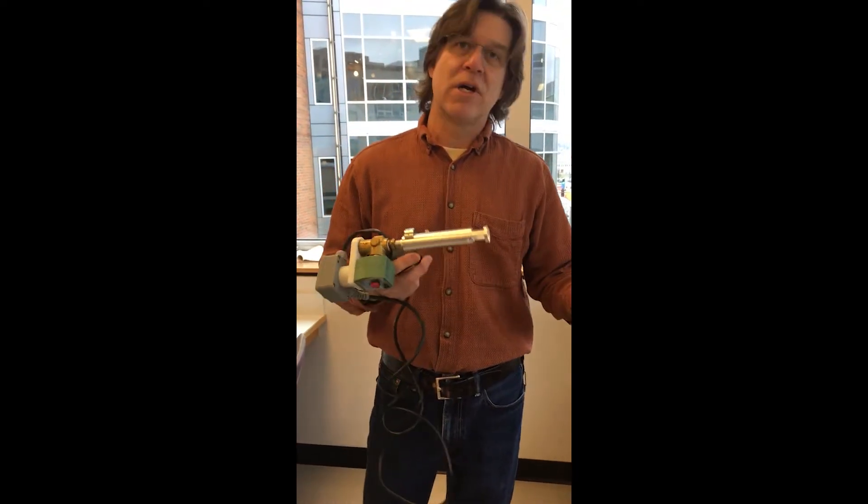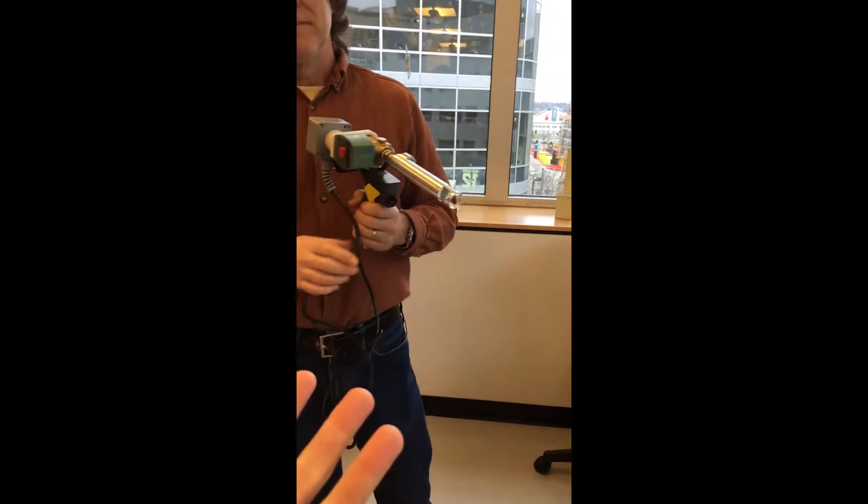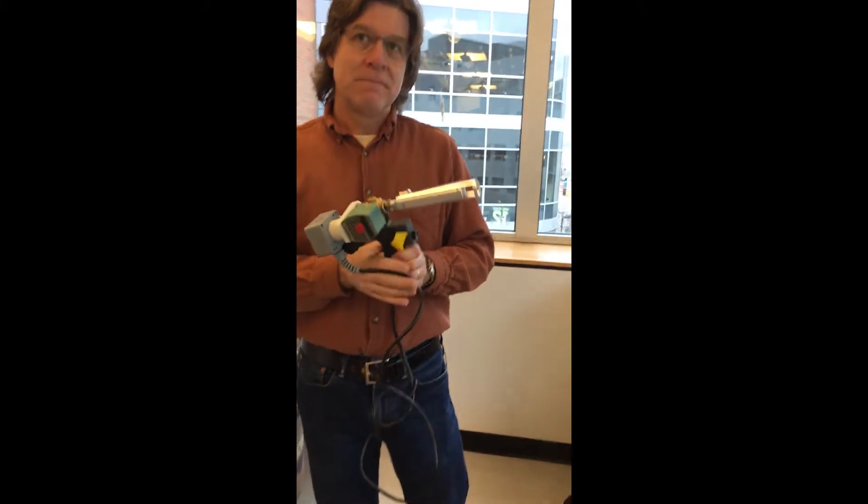So this could be an animal belly, the side of an animal, tissue culture cells, plants — you can do whatever you want. And what are these carrying into the body? What's the goodness of these?